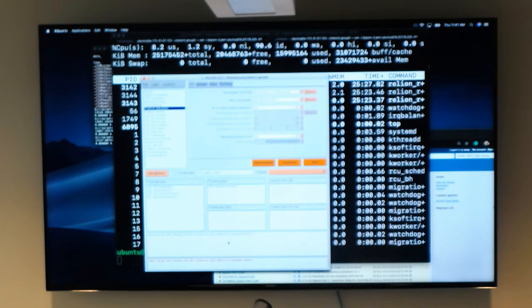This is good. Wait for some more iterations. Kill the short one. Running. Oh, so you got it stuck. And I think it's running now. It's going fine. I have to restart. It'll know that that's the extension, so it'll go in there.